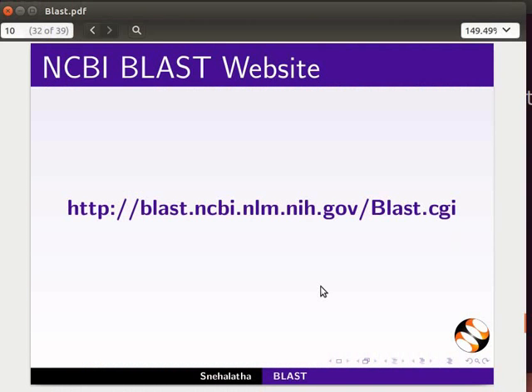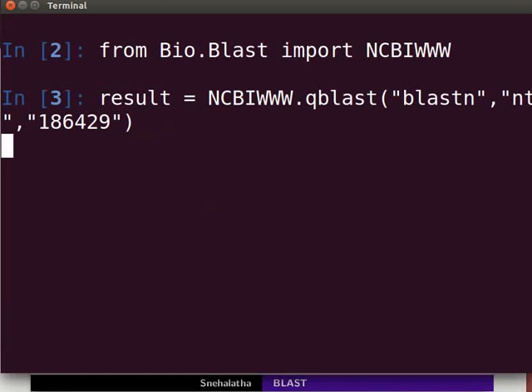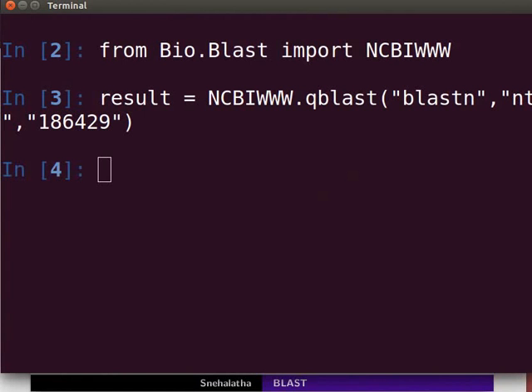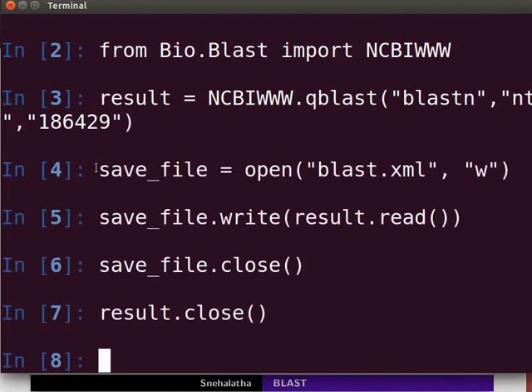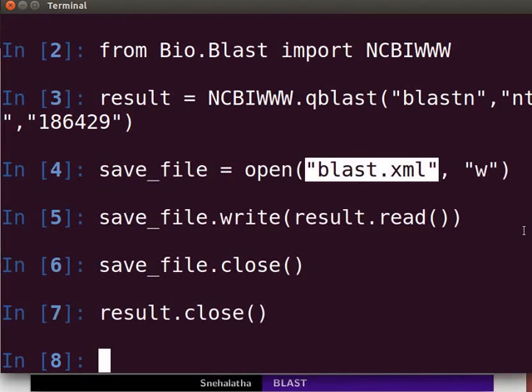Details about this are available at the NCBI BLAST webpage. The BLAST output is stored in the variable result in the form of an XML file. Press Enter. Depending on the speed of your internet, it may take a few minutes to complete the BLAST search. It is important to save the XML file on the disk before processing further. Type the following lines to save the XML file. These lines of code will save the search result as BLAST.xml in the home folder.